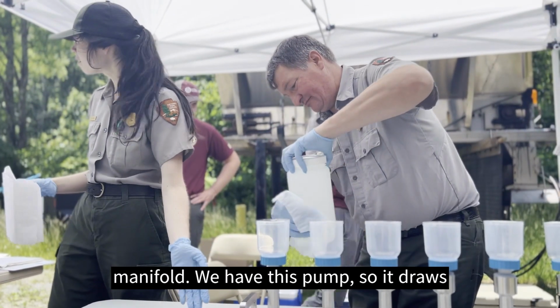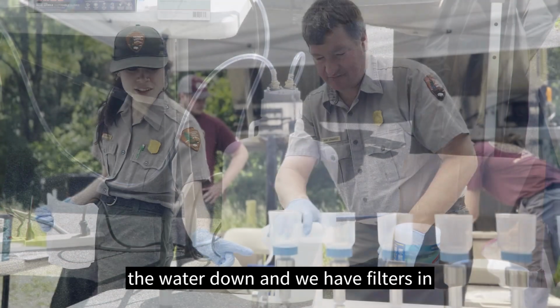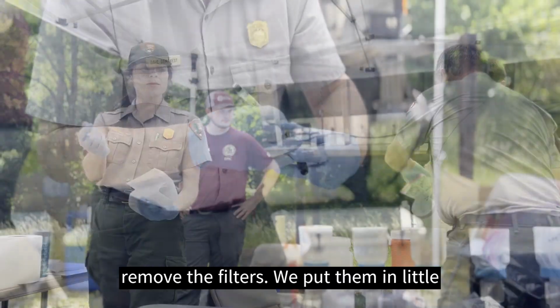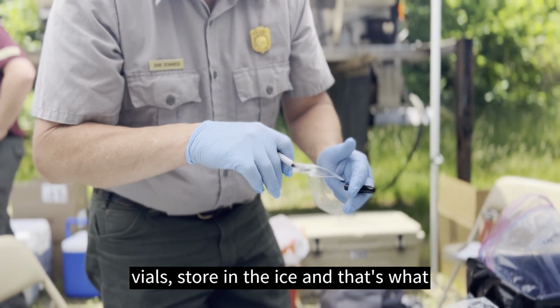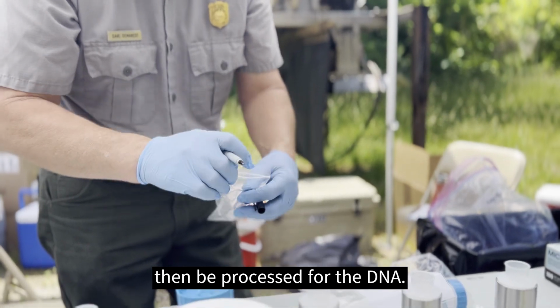This is a vacuum manifold. We have this pump, so it draws the water down, and we have filters in each one of these. And then we carefully remove the filters. We put them in little vials, store them in ice, and that's what we're sending out to Fish and Wildlife to have processed for the DNA.